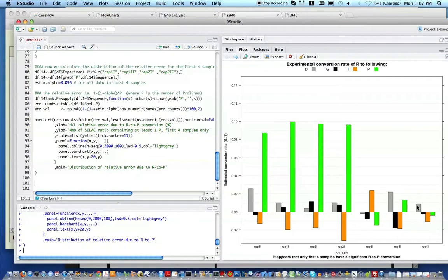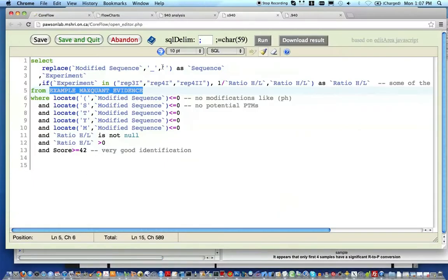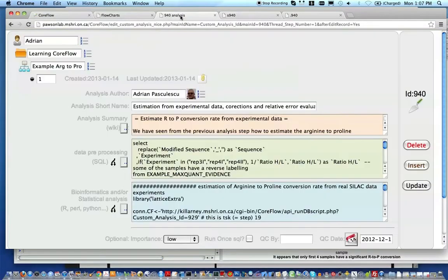Some of the samples have been corrected by the biologists. The same result you have seen also by running our script here on the application server on the internet server. Okay, so this concludes our second presentation. We have seen that we can run everything in our playgrounds.